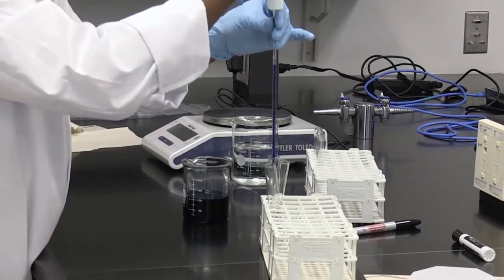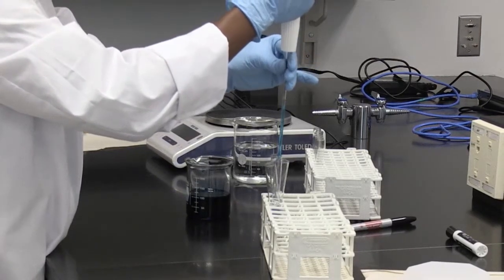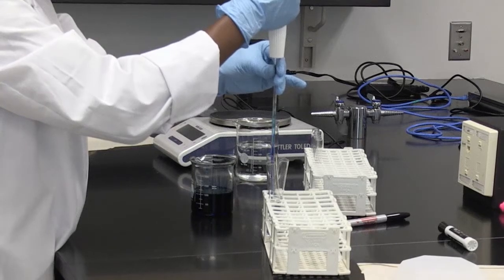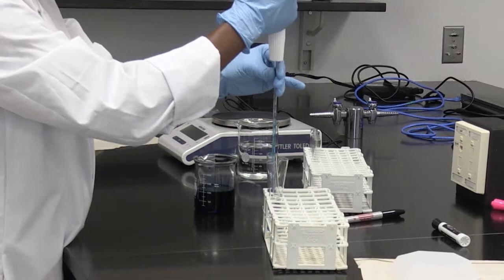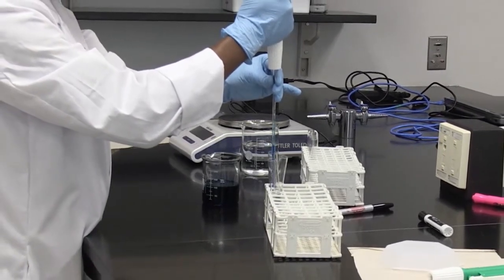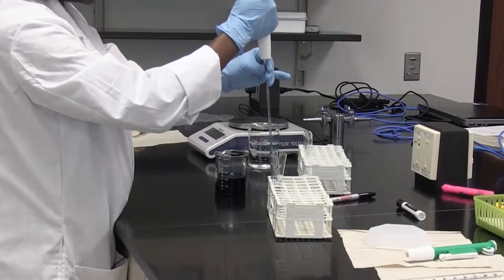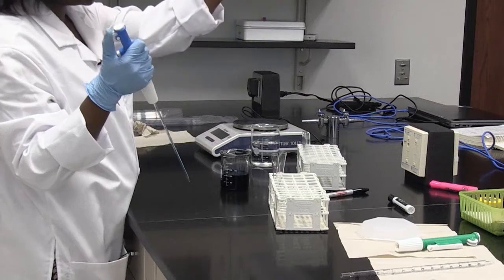When we add this 1 ml, we mix the dye in the water by pipetting up and down. Do it gently, and don't force the liquid out of the pipette tip, so that you don't lose your solution — this will also allow your solution to be accurate. After pipetting about 5 or 6 times, I have made my 1 in 10 solution.